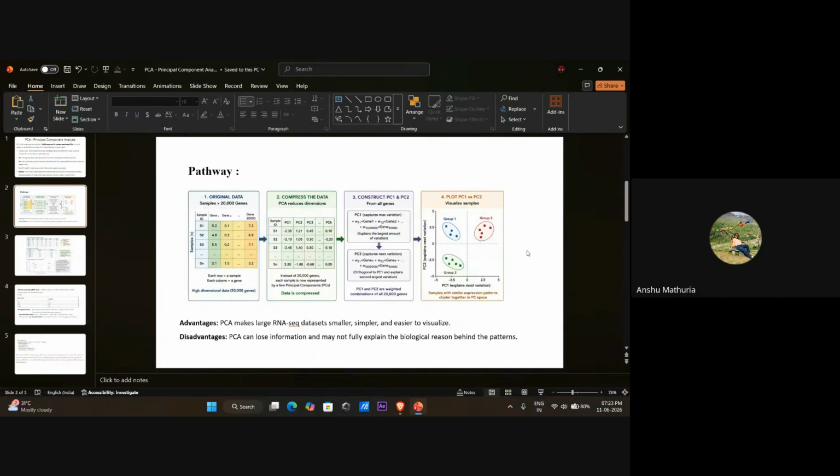Okay. The same question I want to ask: did you also go through the mathematical part that is happening behind the calculation of PCA? Yes, ma'am. Here we calculate the gene weight, ma'am. Firstly for PC1, if you have a gene expression, like if a person is taken as an example, we analyze the height and weight and so on in PC1.